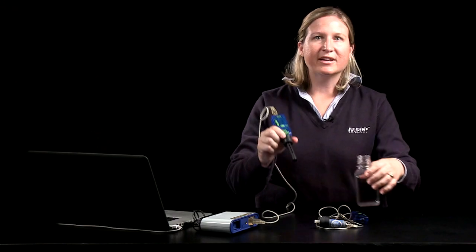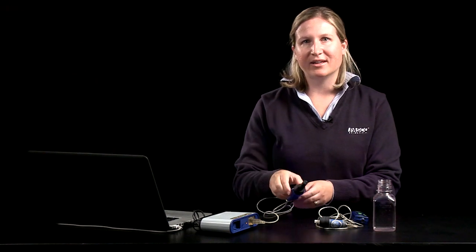For each of the demonstrations that I'm going to show you today, I've already calibrated the sensors. So the first activity that we're going to look at will help your students understand diffusion and gas exchange in the lungs. So let's go ahead and get started.